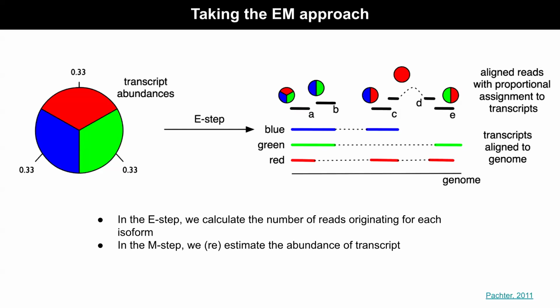This is the same principle that is used to partition this, right? You don't know which began from where, but you can use the same principle to partition. So we'll do this exercise in the next class, and I'll talk about the actual methods before talking about other techniques to deal with this data. So just 30 more seconds. Once you get this data about D1, D2, D3 across multiple samples, the first thing that you want to see is how similar this data is across different donors. So we'll talk about analytical methods to deal with it, PCA, SVD, dimensionality reduction, and so on in the next class. Okay, thank you, and sorry for taking 5 minutes again.